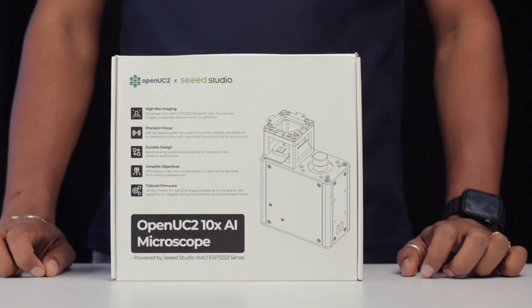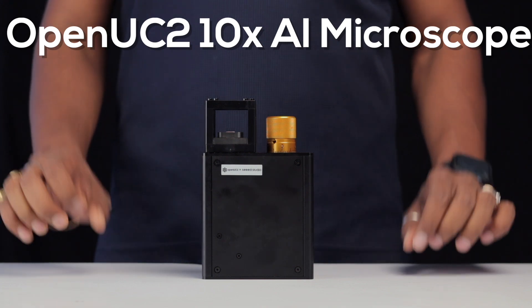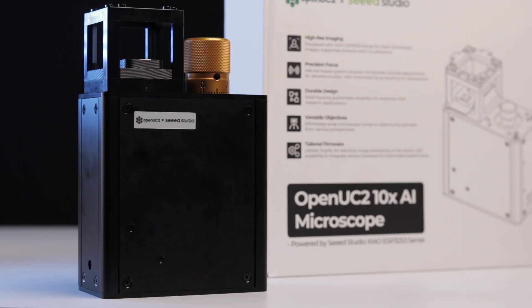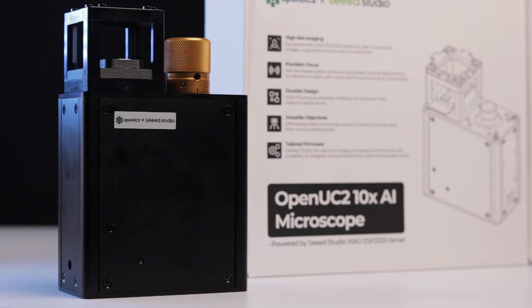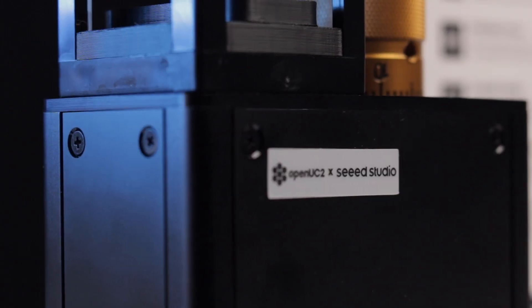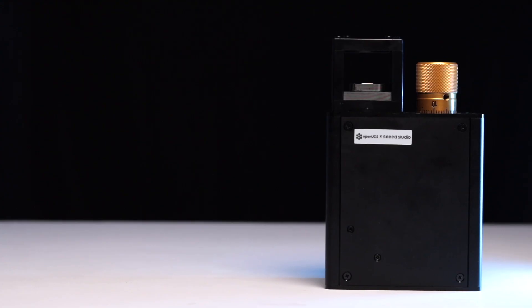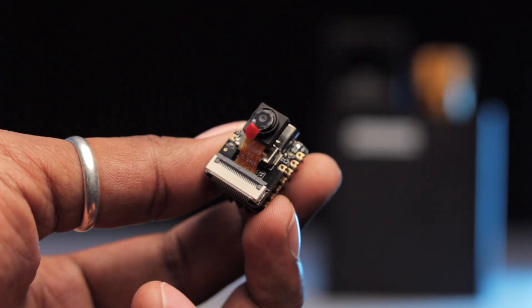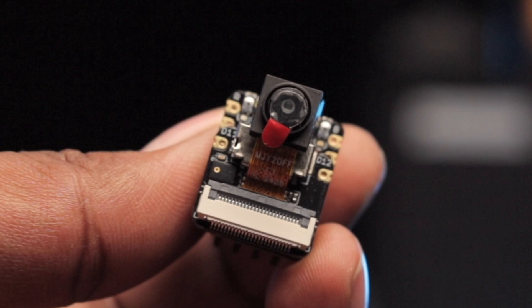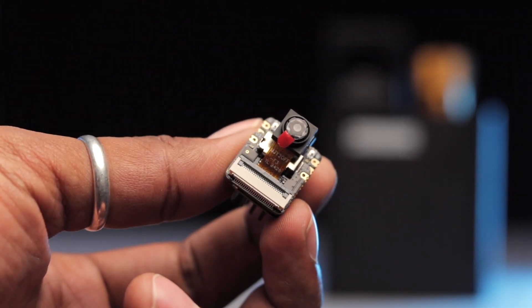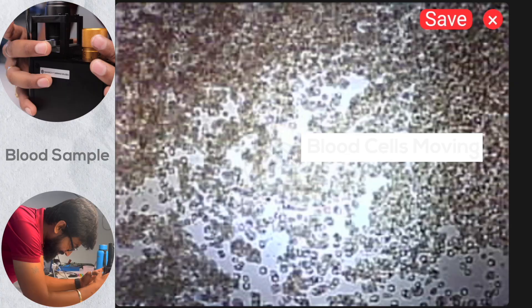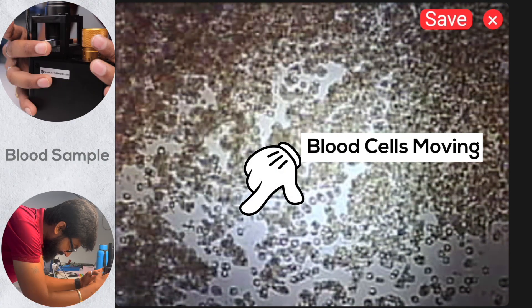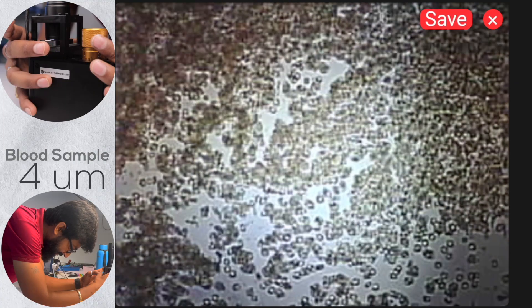Today I got my hands on a really fascinating product from Seeed Studio called the OpenUC2 10X AI Microscope. This innovative device is a collaboration between OpenUC2 and Seeed Studio, and it's based on the XIAO ESP32 S3 Sense Board — the tiny little camera board that fits in your fingertips — which is the heart of the microscope. Don't get fooled by its size, as this device can analyze particles as small as 4 micrometers.